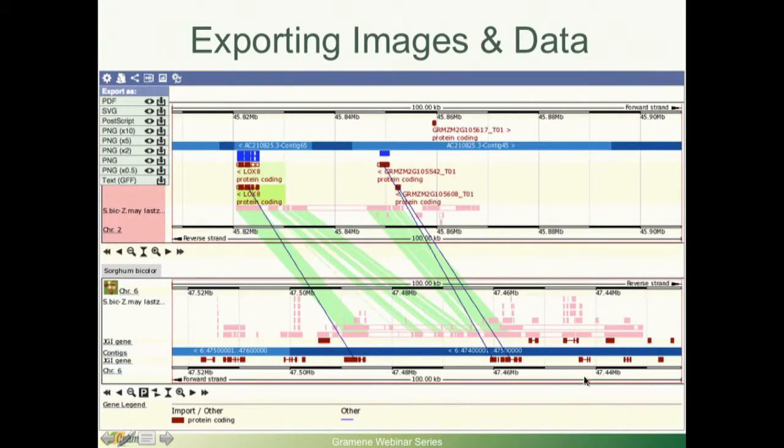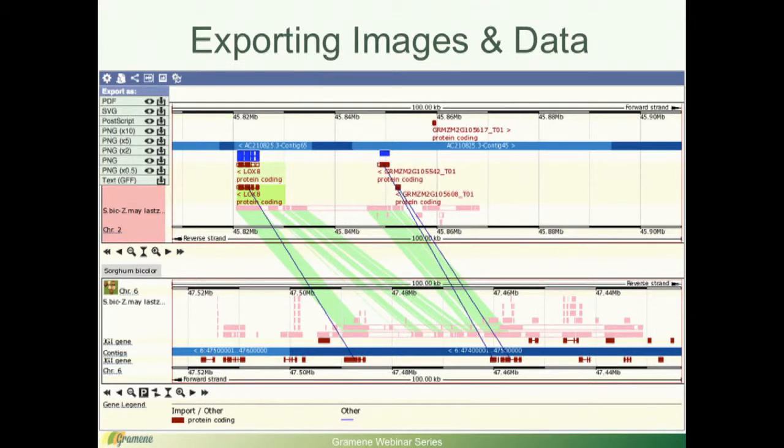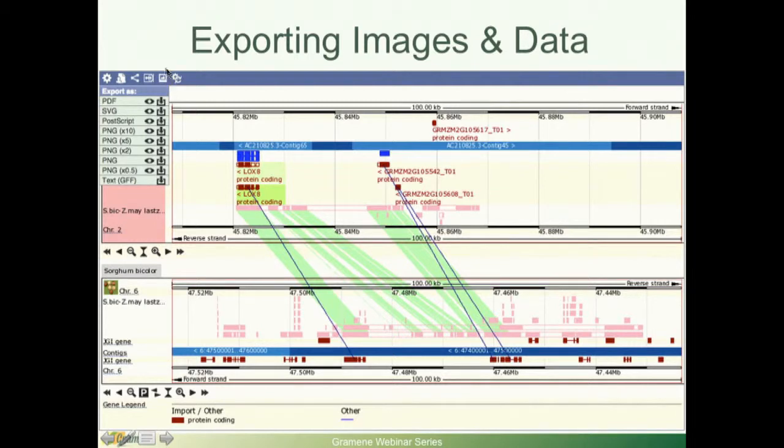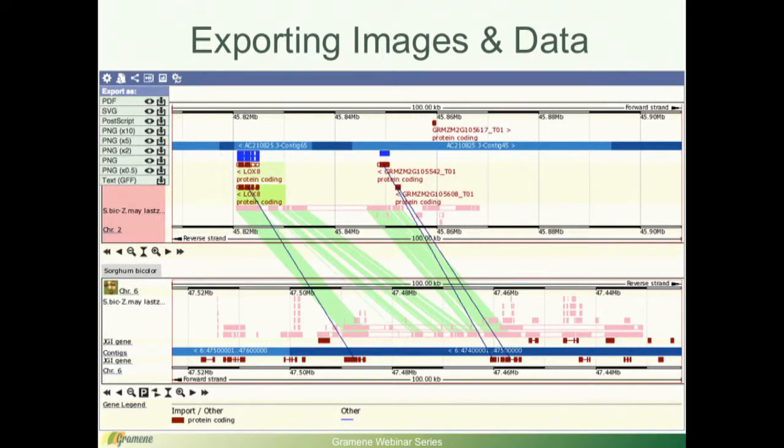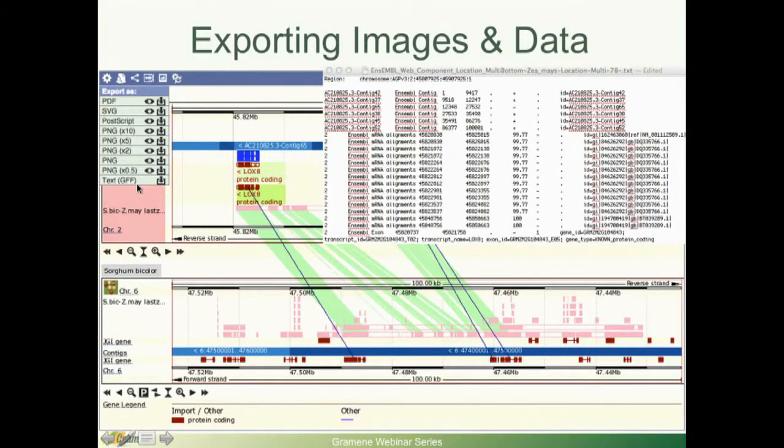Now, let's say that you have an image that you are satisfied with, you added and removed tracks as you wish, selected your favorite styles and you want to export this image. So the way to do that, you are going to click on this icon over here, which will tell you that that's useful for exporting and you can export your images in these formats or your text as GFF. And this is how your text would look like.